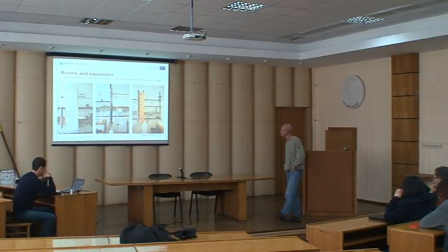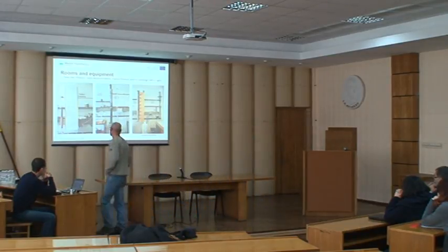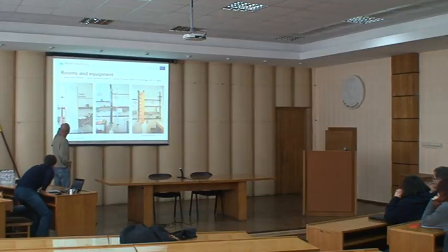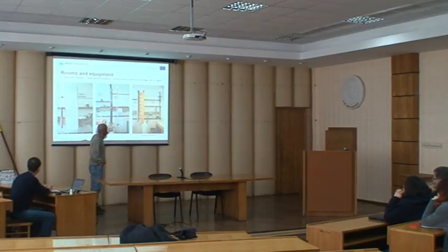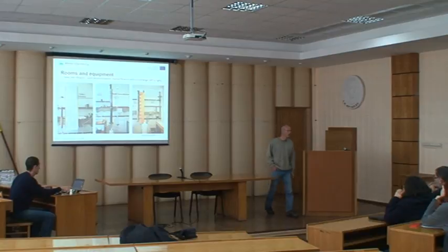So these are some pilot plants, or a little bit smaller than pilot plants, for the lab training using Professor Fettig. So we have the deep bed filtration here, rapid decarbonization over here, and ion exchange, this small column over here. All the units are used in the practical training program.